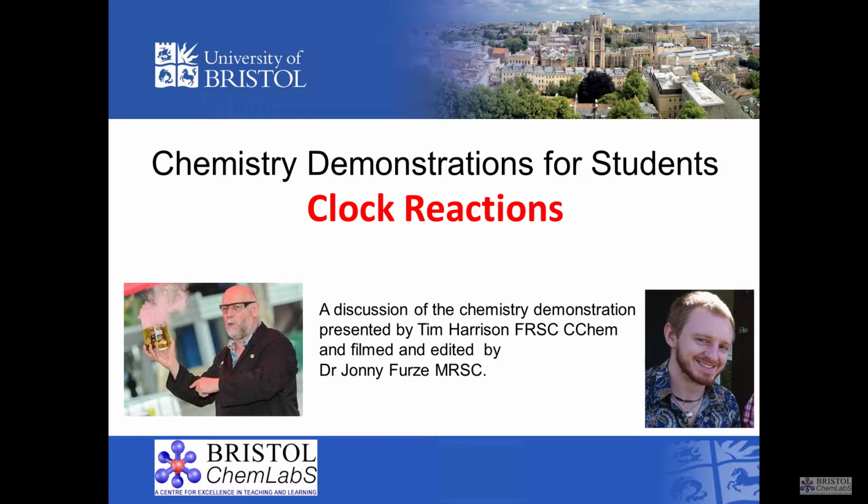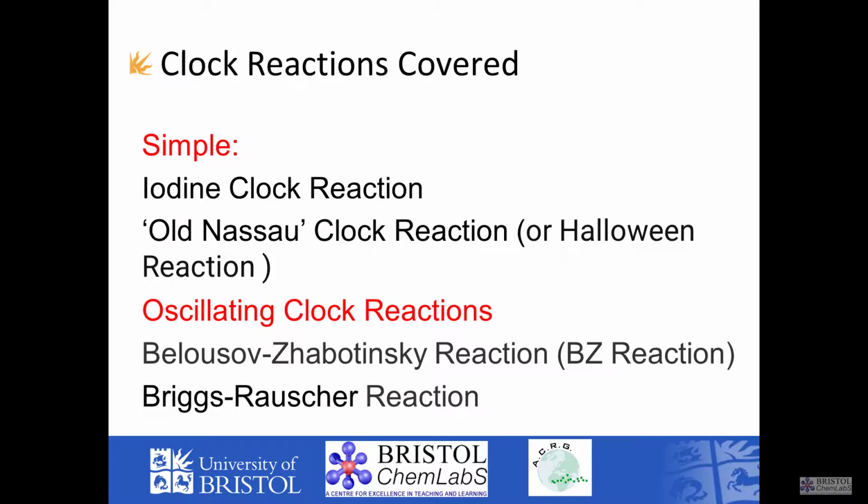In this video, there are 4 reactions we want to show you that all come under the heading of a clock reaction. The first 2 are one-offs in that there is an end point which is fairly obvious. In the last 2, they are oscillating clock reactions which change backwards and forwards. The chemistry for all these reactions is fairly complex, so this will be a light touch treatment.